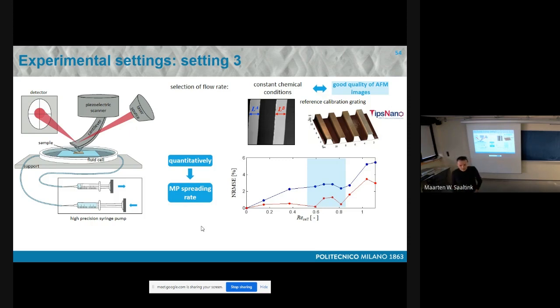I totally agree, and that's why I'm hoping that with this new system, by considering the flow condition, we can even keep the saturation constant. That was one of the key points. Otherwise, you really have not much control. Conditions are changing during the experiment. Exactly.